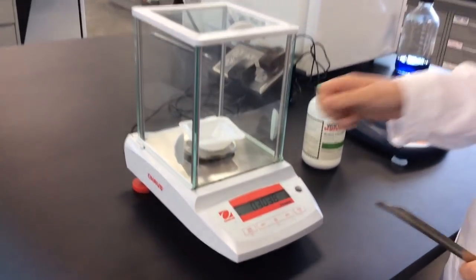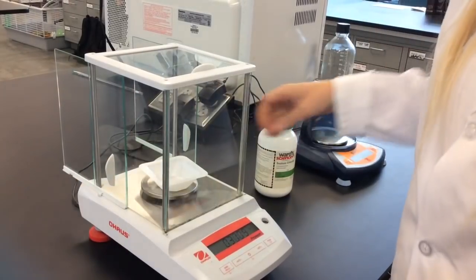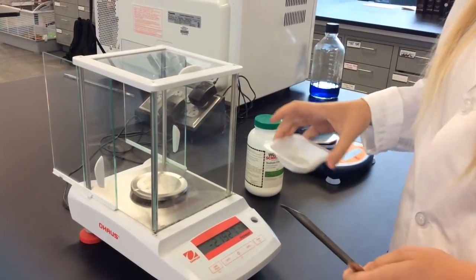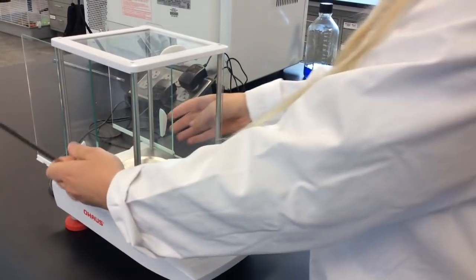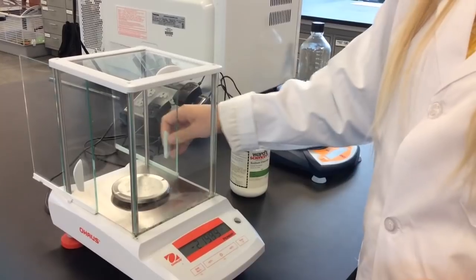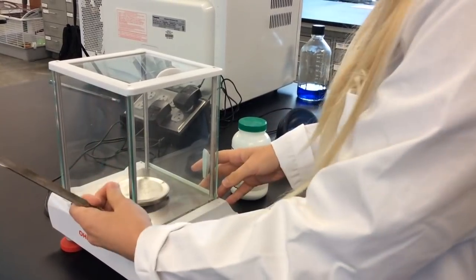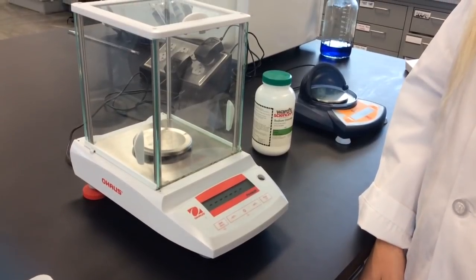We will write it down in our lab notebook. We can open the balance, grab the weigh boat out, and pour it wherever we need to in our lab experiment. Wipe anything off — if there's any salt inside, just wipe it down, close it up, and it is ready for the next student to use.